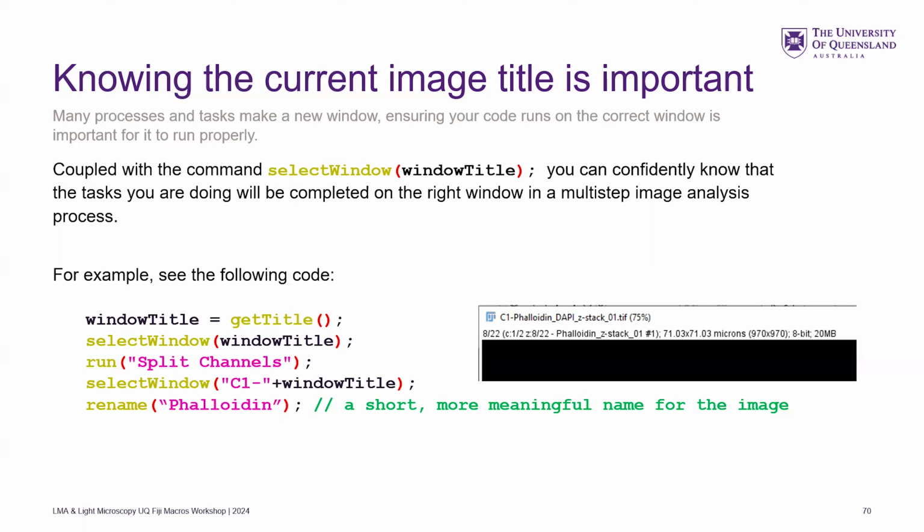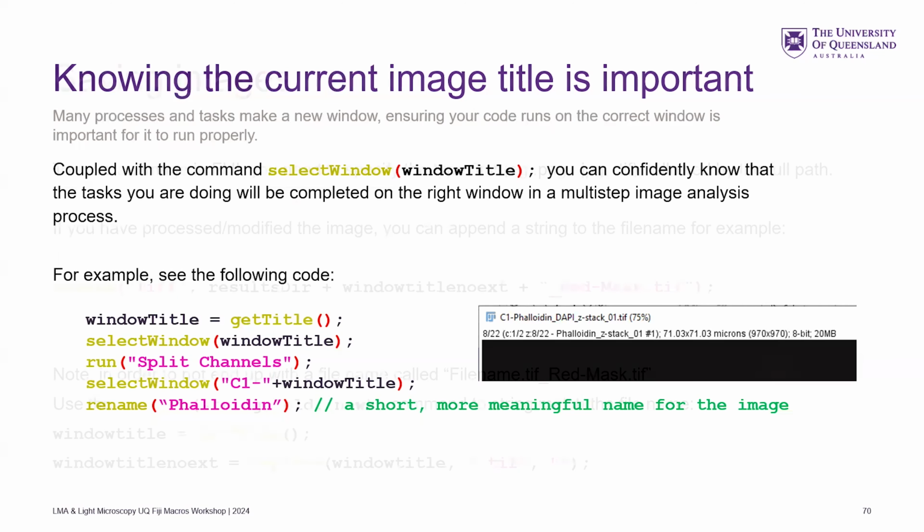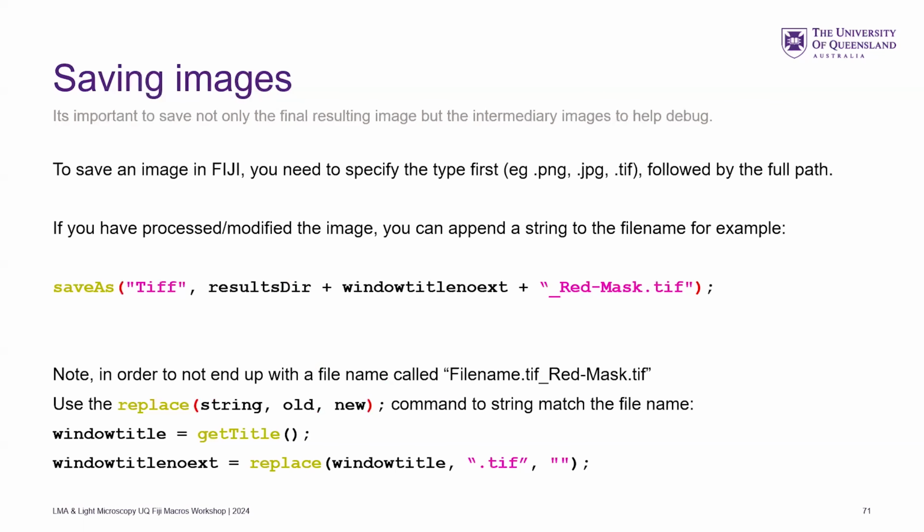Something you may notice with a lot of my code is I always use the same thing. If I write code for one person and then 3 years later write code for someone else, I always try to use the same generic variables, because you're just going to copy paste your code from other bits. If you always call it the same thing, it'll save future you some time. Bit of a tip. There's one extra slide before I get into the point I'm trying to make there, but basically, if you're consistent, it'll make your life easier.